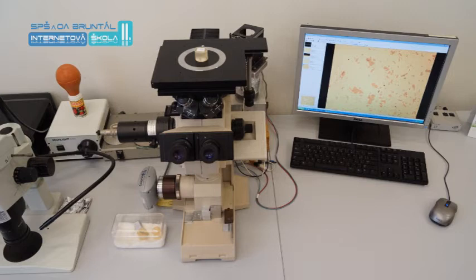The image created by the objective is further magnified by the eyepiece. Microscope magnification is determined by the product of objective and eyepiece magnification.